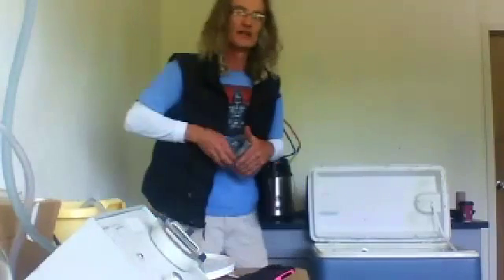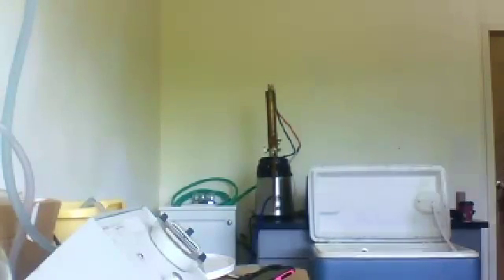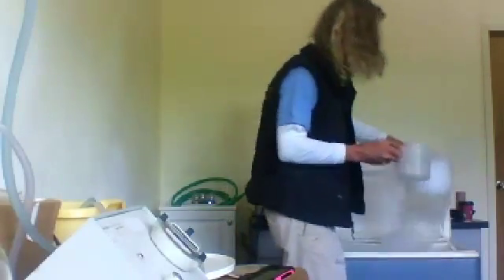Okay, here we go. I'm going to cool everything down. The temperature I'm going to cool down to is probably around, let's have a look, about -40. So here we go, liquid nitrogen. That beautiful sound. Always wear gloves. I've got calluses on my hands from dry ice. So what I've done is pour it in the alcohol here, just cooling everything down.